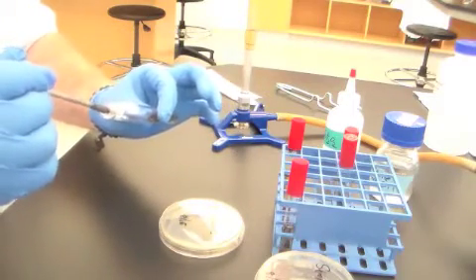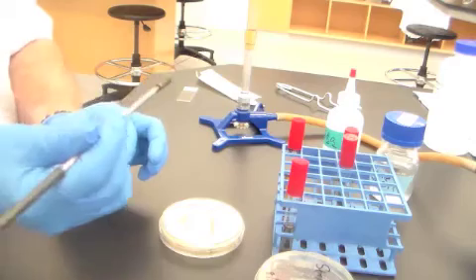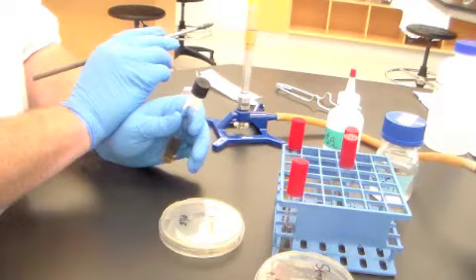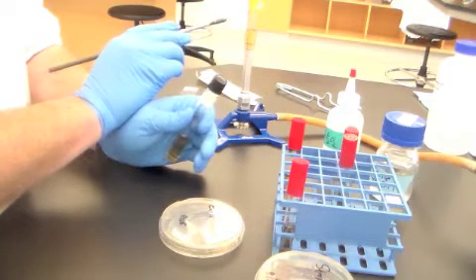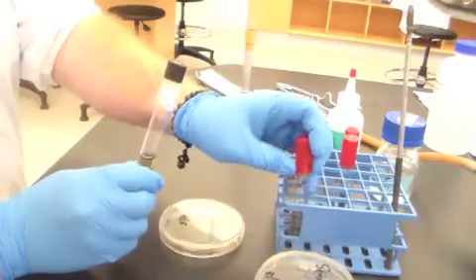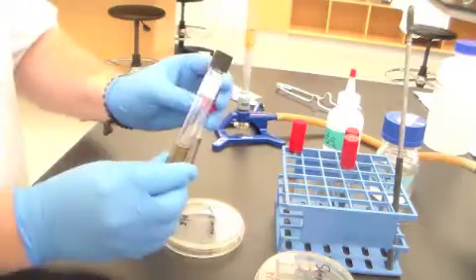Now, the tubes that you may be using that the TAs are making up for you for ornithine may not, in fact won't, look like this. So it's important that you label the media, because what's going to happen invariably is that some unfortunate lab group, not yours, but some unfortunate lab group is going to pull out 2 inoculated and fully grown tubes and not be able to tell which one is lysine and which one is ornithine.